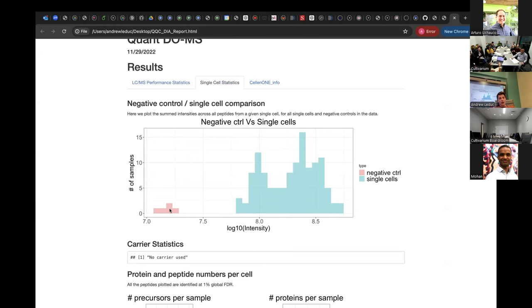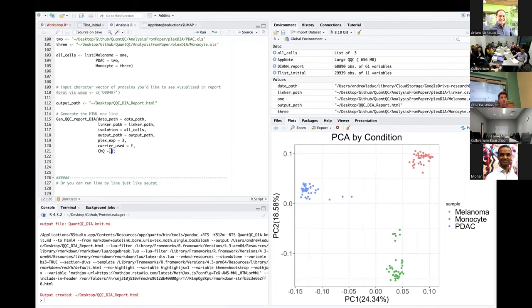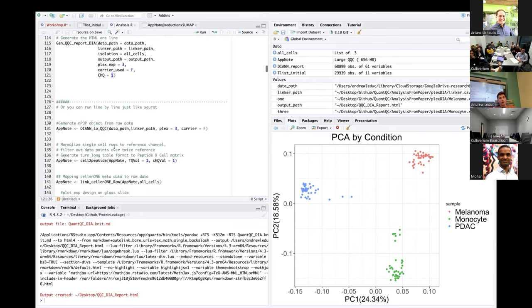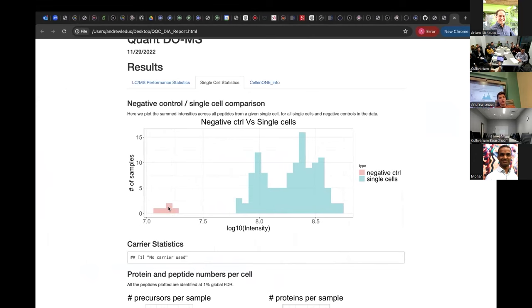Again, I talked a bit about this channel Q value. When I did this report, I set this channel Q value to one, so I essentially am not filtering at all, not being stringent in any way. If your analysis is averse to false positives, like you're doing marker identification in cancer cells or normal cells, you would want to crank this value down to like 0.01 or something, so you don't end up with incorrect results. You can also run it line by line, which I'll show you in a bit, but these will drop out entirely if you're more stringent with that value.